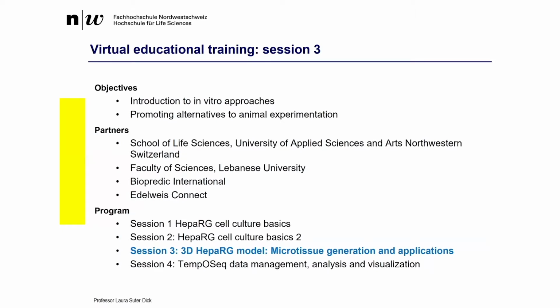This third session, the first two sessions, you have seen the cell culture basics, and now we're going to go to a more advanced model, how we can use the HepaRGs in a more complex microtissue generation.